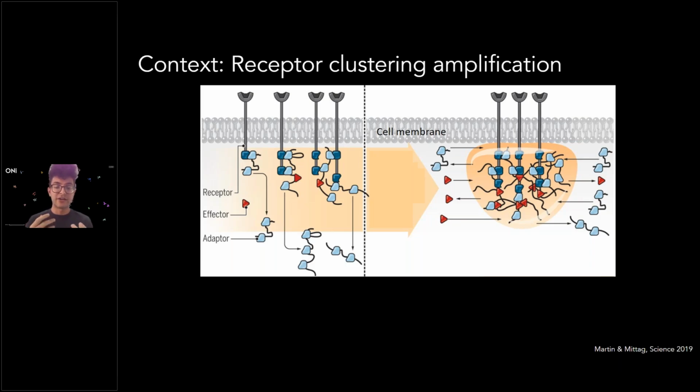And this can lead to a kind of runaway cascade, and that means that that signaling may trigger some response from the cell or may cause these receptors to clump even more tightly depending on the mechanism. So this is an interesting process that we might want to look at by labeling these receptors and seeing how they cluster in different conditions.